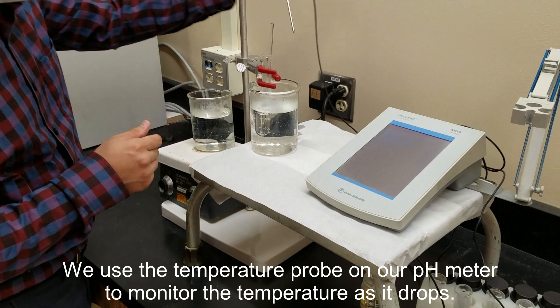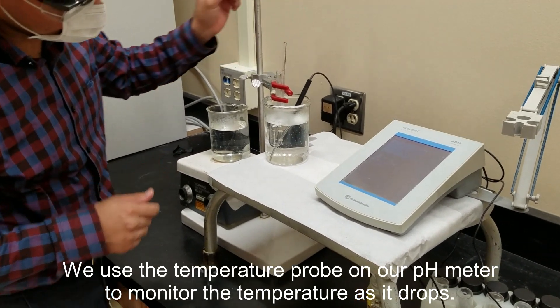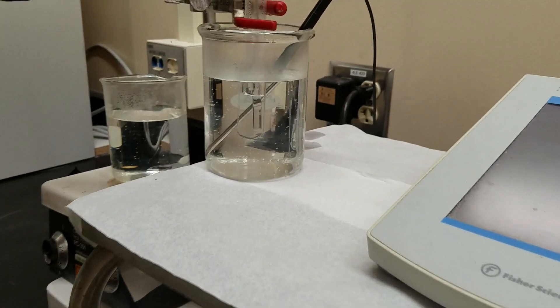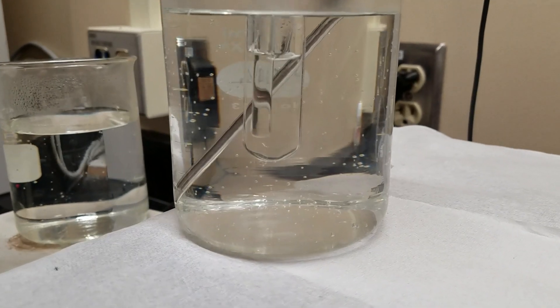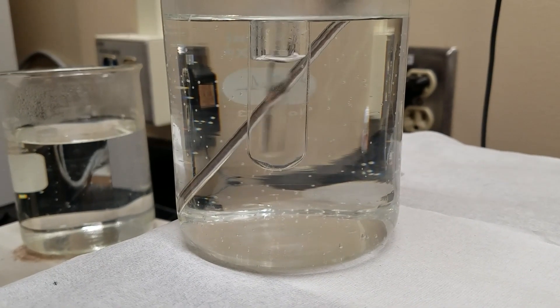We'll be using the temperature probe from our pH meters to monitor the temperature as it falls. We'll gently stir our solution and keep an eye on it to watch for precipitate.